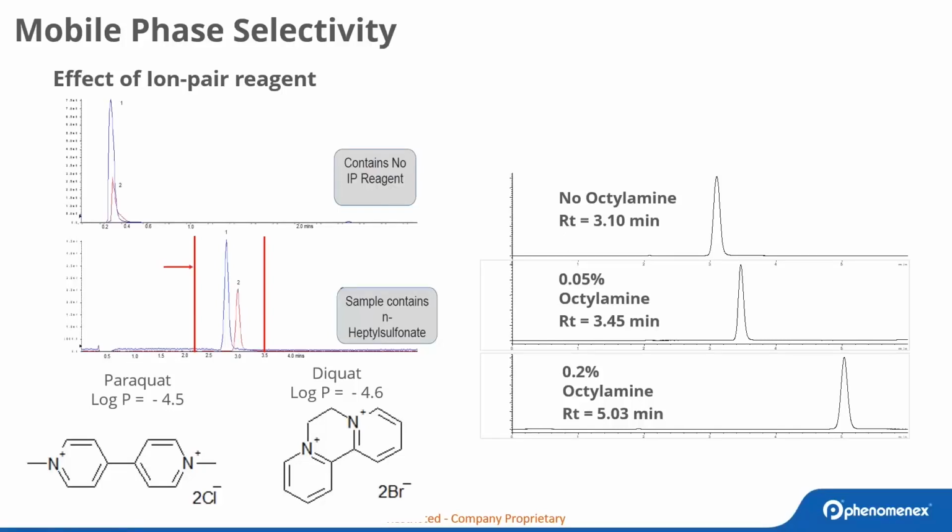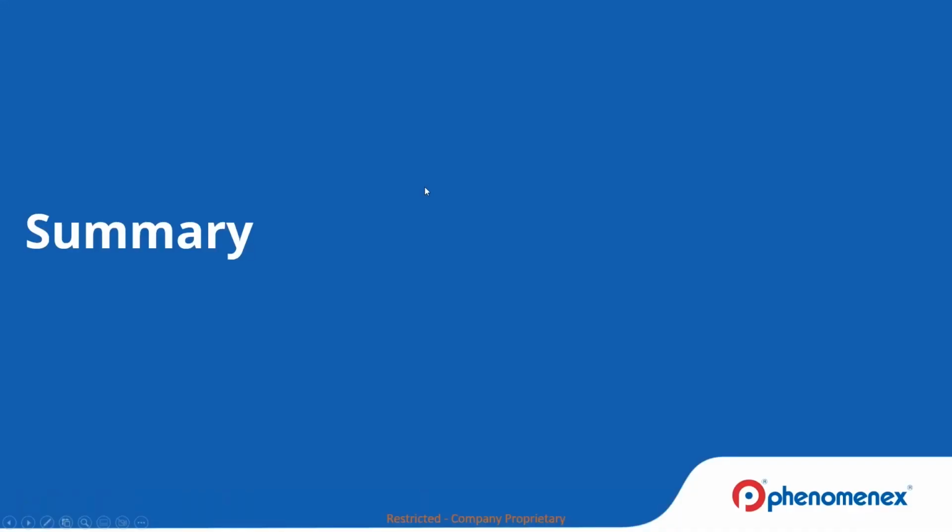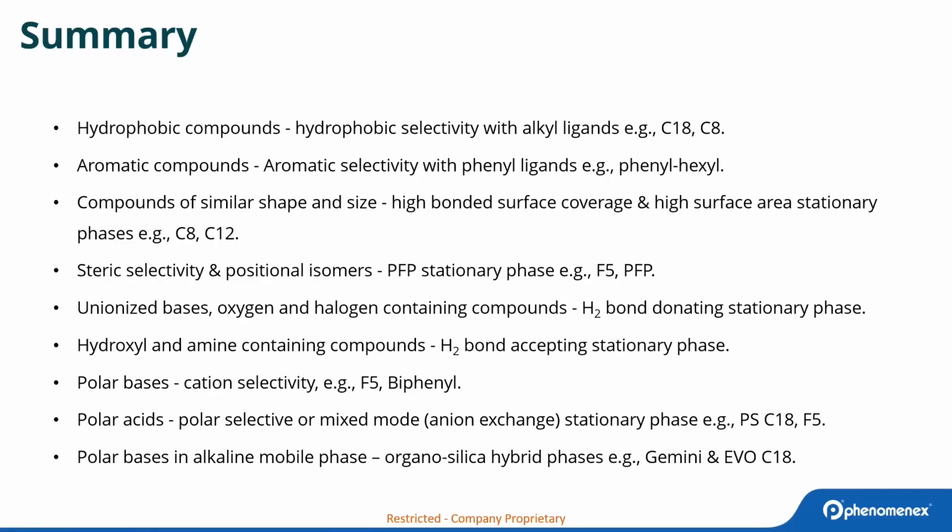So the different strengths can also impact the resolution. It's important to be clear about what concentration of ion pairing reagent you need to be adding, because the retention time can shift based on that. And with that, I will go into the summary of what we talked about today.